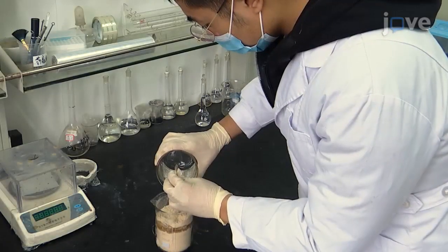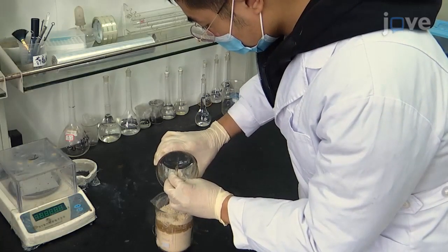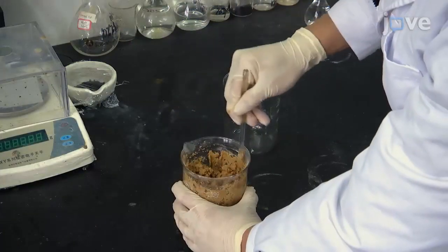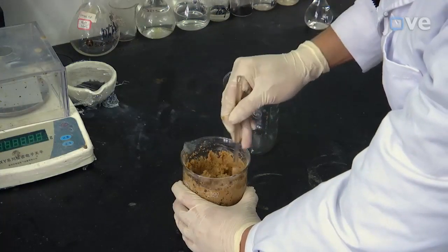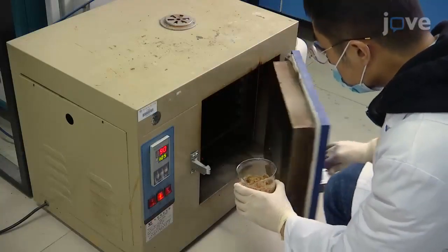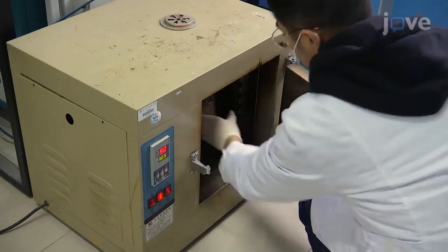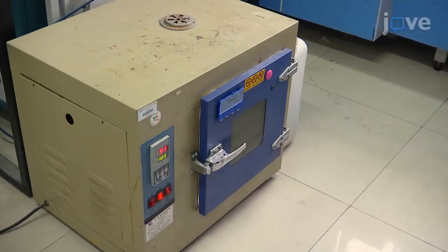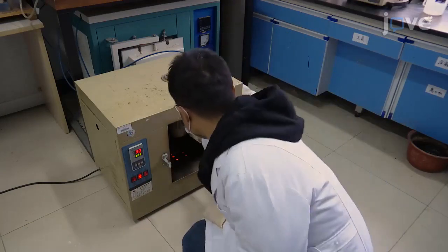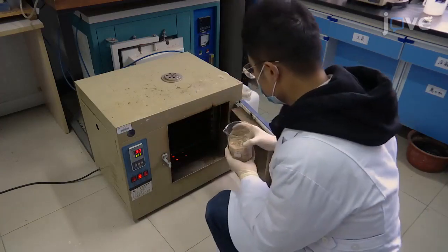Now, place 30 grams of fine bagasse powder into a 15-weight percent phosphoric acid solution in a 1-to-1 weight ratio for 24 hours. Dry the mixture in an oven at 105 degrees Celsius for 6 hours. Collect the resulting product as the precursor for bagasse-based activated carbon, or BAC.